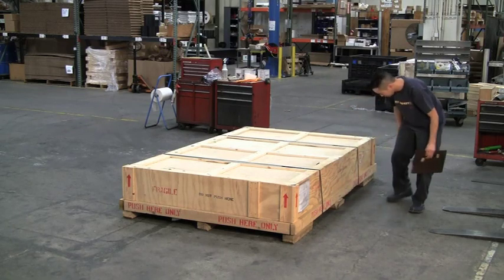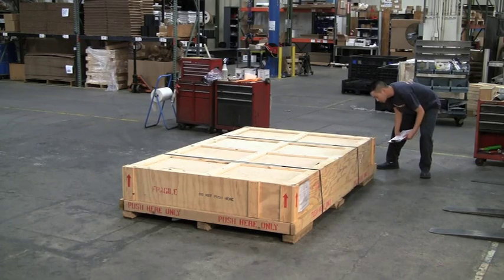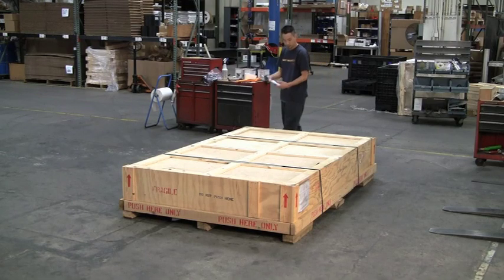Newport table crates are specially designed to protect the contents, even if the crate is cosmetically damaged or mishandled. If the crate will be in storage before installation, be certain it is protected from harsh environments.